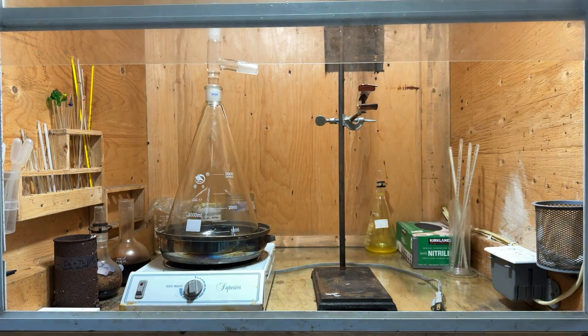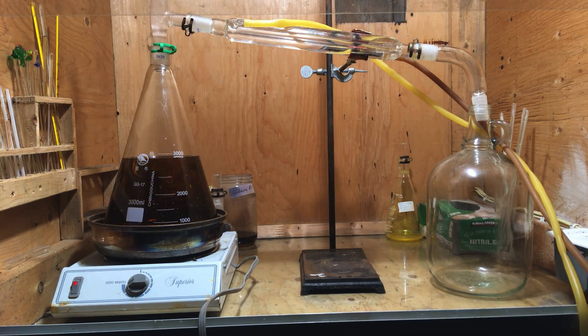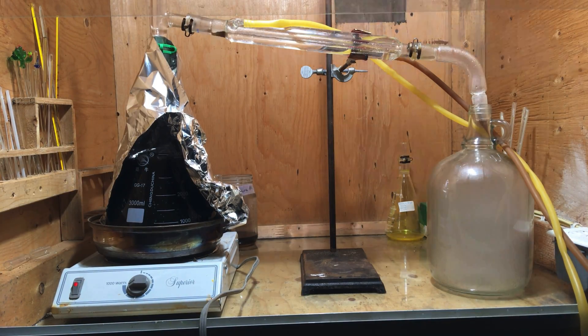A simple distillation apparatus was assembled and the mixture was heated. As the reaction temperature increased, it slowly darkened and then turned black as material began to distill over.